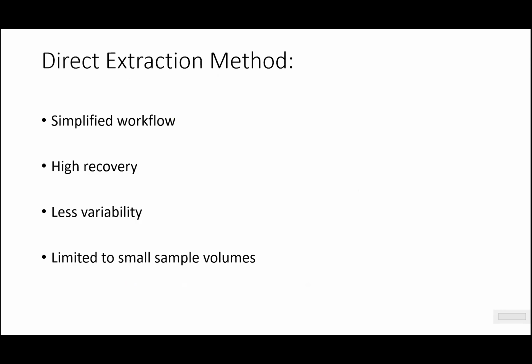And so I'll summarize some of the advantages and disadvantages to using this type of method for detecting SARS in the wastewater. Starting with simplifying workflow, there's less processing involved, and so this increases throughput, allowing us to analyze more samples at once. There's minimal loss during the process, which makes sense. Silica-based RNA extraction purification chemistry has been well characterized over the years. It has been shown to have a high recovery with relatively low variability.